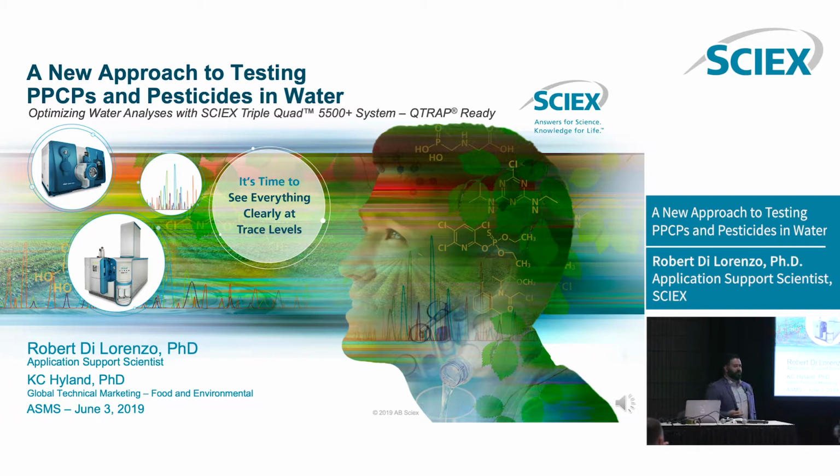Today I'm going to be talking about, again, the 5500 plus system, an application looking at PPCPs and pesticides in water samples. Working in the Concord lab, in the Toronto lab, sometimes you get the rare opportunity to take a peek behind the curtain and see what's coming.